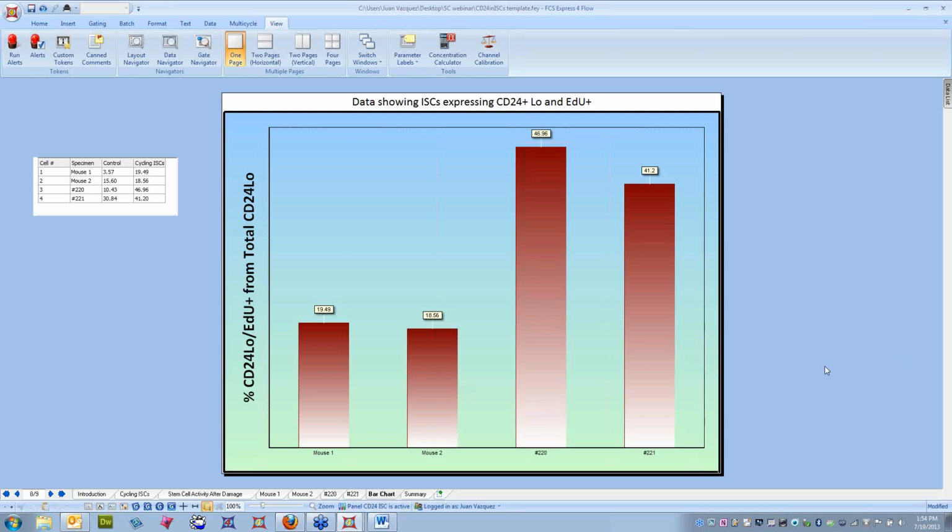But for somebody to quickly flip through a journal and see a panel including both, they can look at the bar chart and get the message. So I'm really excited to try this on our data. We only have this NF2, but it's something we're working on, and I'm having a lot of fun with these custom tokens. It gives you as much complexity as you want with regards to calculations, and so hopefully I'll be fluent in this soon. And I'll hand it back to you, Juan.